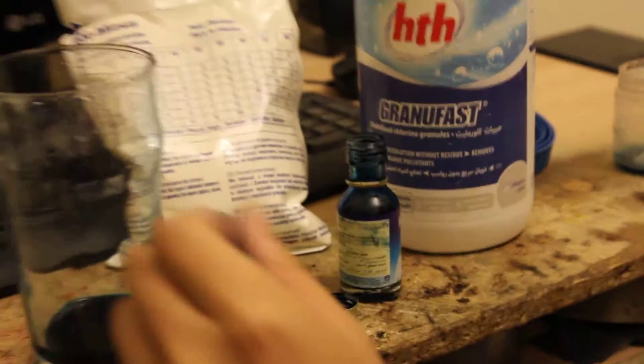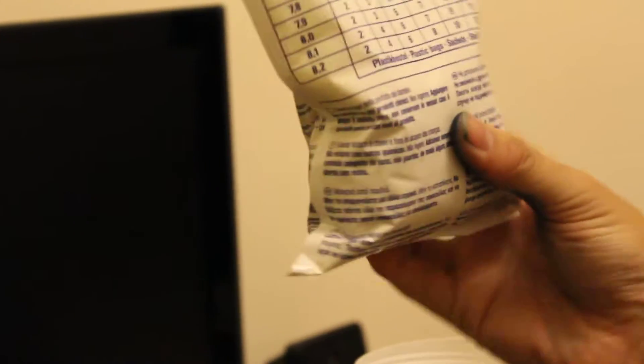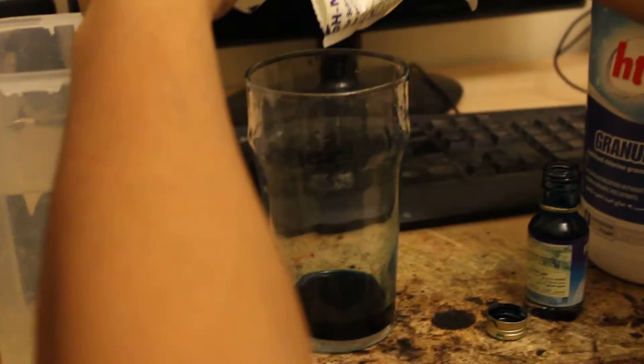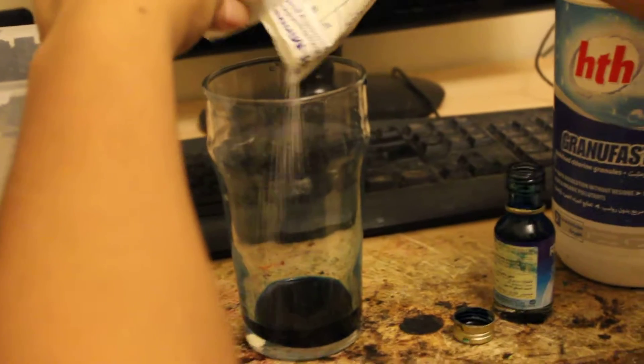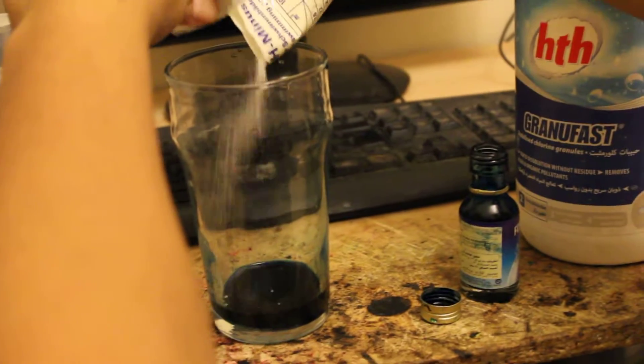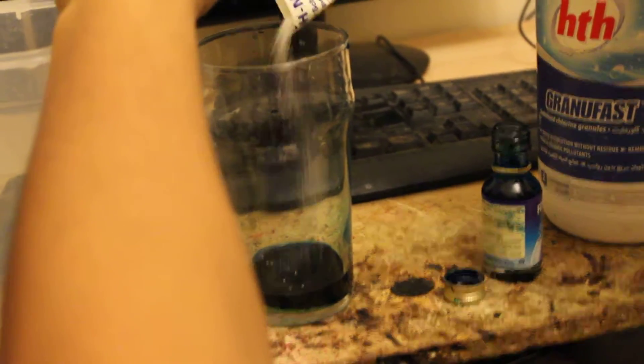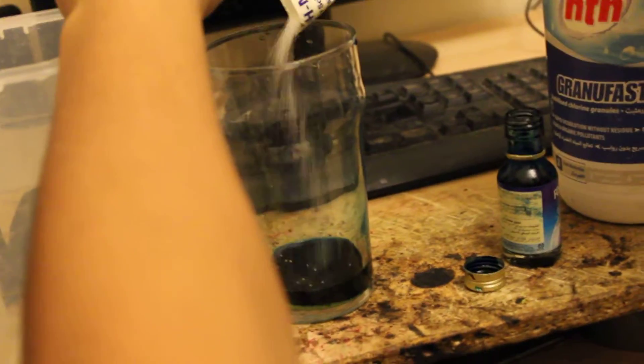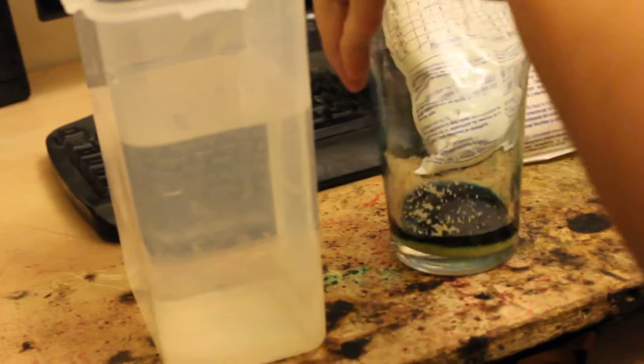So what you gotta do is you need a strong mineral acid or a partially neutralized acid salt. In this case, I'm using sodium bisulfate, but hydrochloric acid or sulfuric acid would work better. What you do is you add your acidic salt or acid to your indicator solution. You gotta be generous with this salt because it's not that strong.